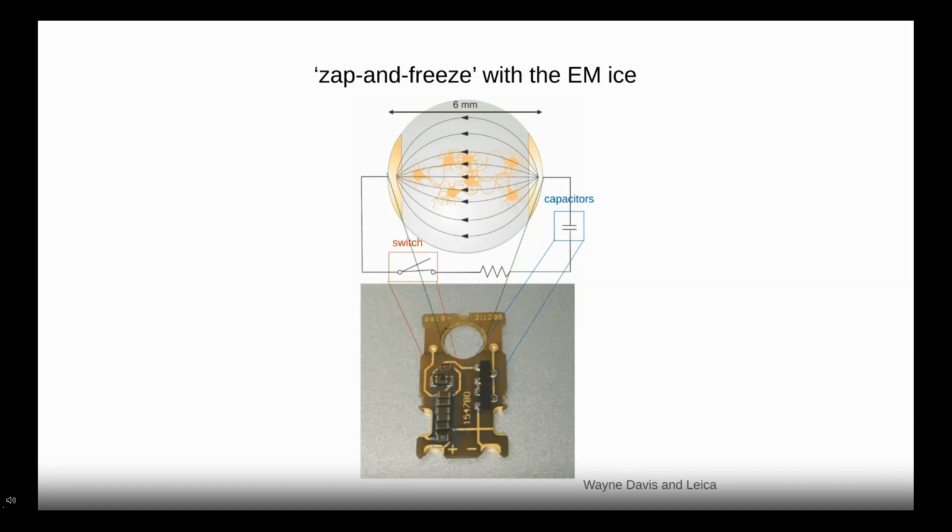And just a quick note here, all these things are very fancy, and this is a real technical advance. But on the side of the experimentalist, it really doesn't add any extra difficulty to a high pressure freezing experiment. Really, everything on my end is very much the same. All you have to do is just set everything up, you close the cover on the machine, and then it goes in. So there really is no added special technique on the part of the experimentalist to doing a zap and freeze experiment. In fact, I find this to be one of the easiest configurations to work with, despite the marvelous results that you'll see that we get out of it.